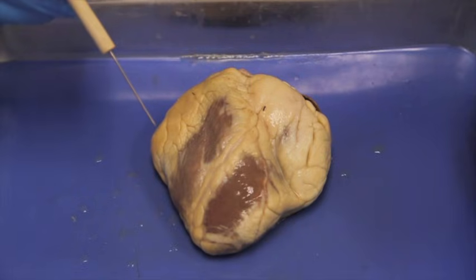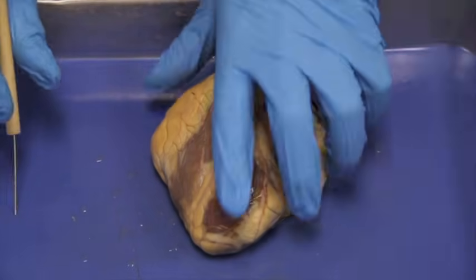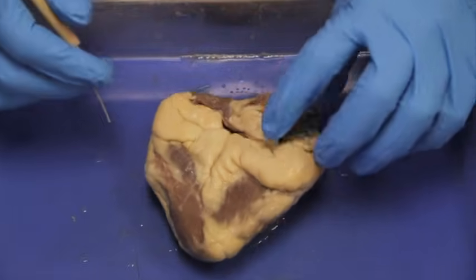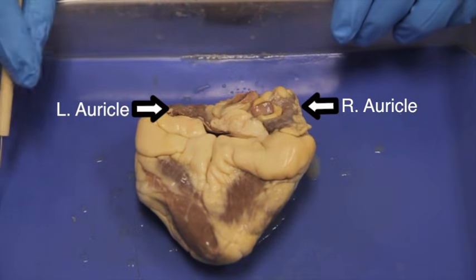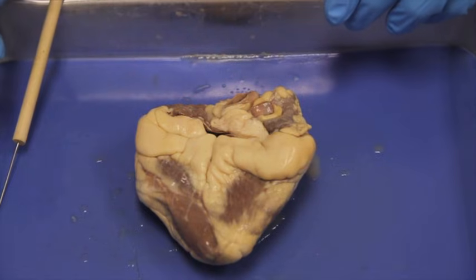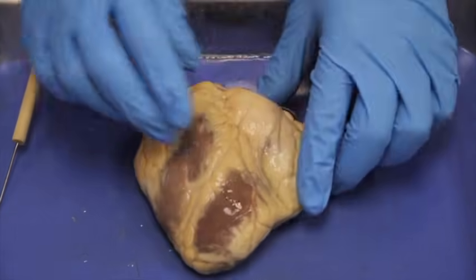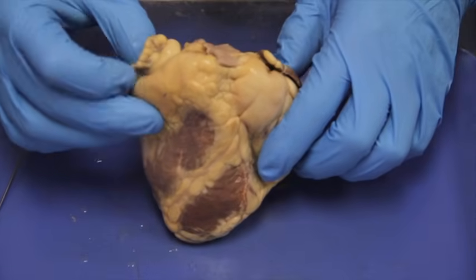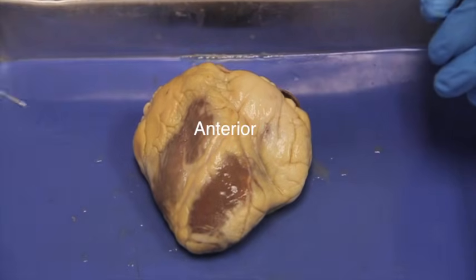Now we need to find what is the anterior and posterior side. The second external features we need to find are the left and right auricles. In order to find the anterior side, they should be peeking around the corner like ears — because in Latin, 'auricle' means ear. Here they're not peeking around, so let's take a look at the other side, and we can see the auricle is peeking around there and peeking around here.